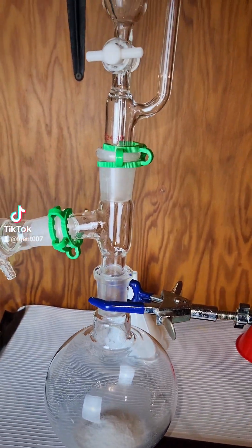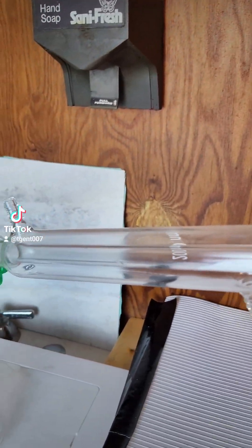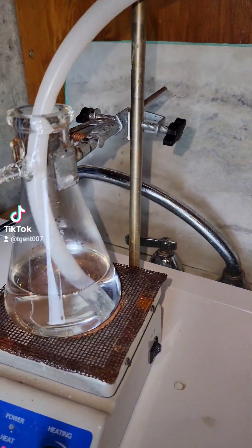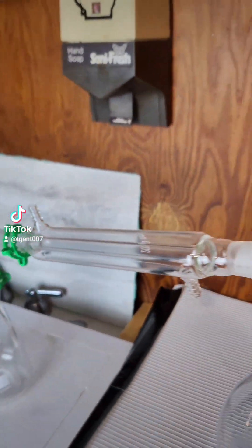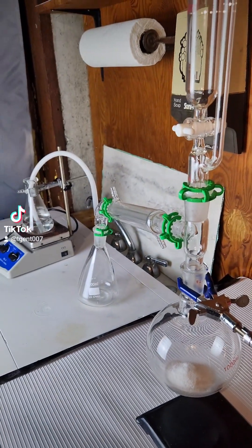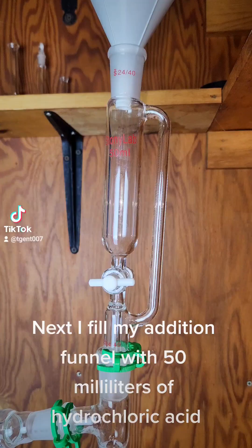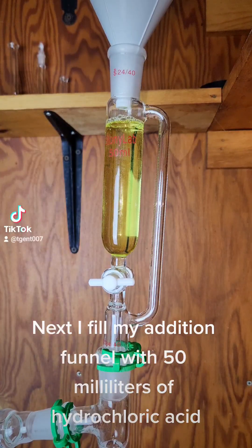This is the setup I constructed to perform the reaction. My addition funnel will allow me to add hydrochloric acid slowly without letting my sulfur dioxide escape. The collection flask serves to prevent reflux, and the gas will be bubbled through hot 60% nitric acid. Next I fill my addition funnel with 50 milliliters of hydrochloric acid.